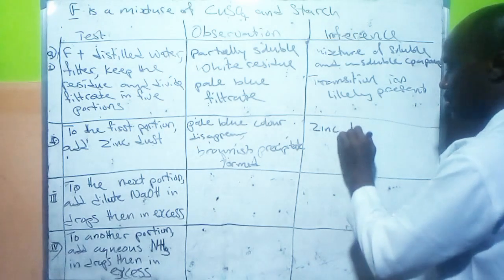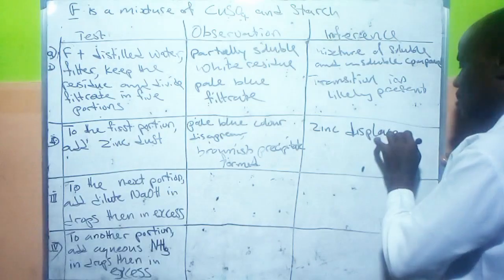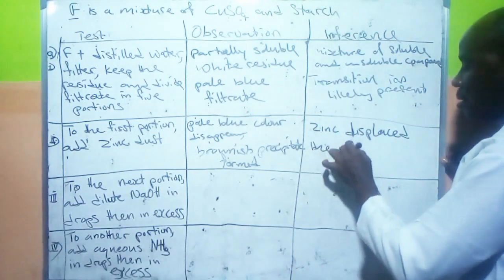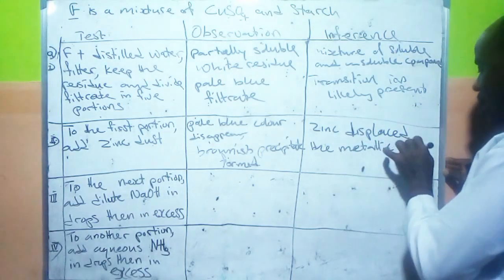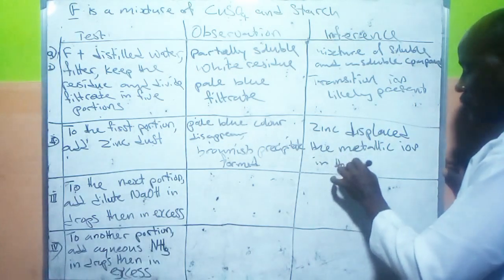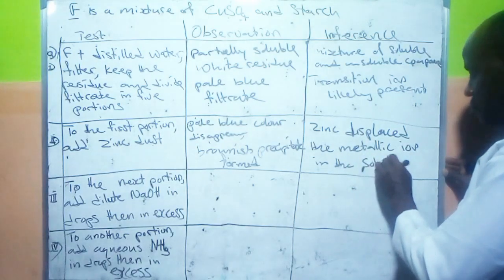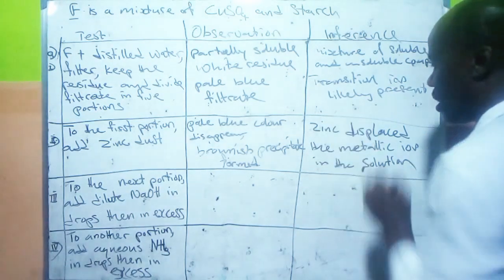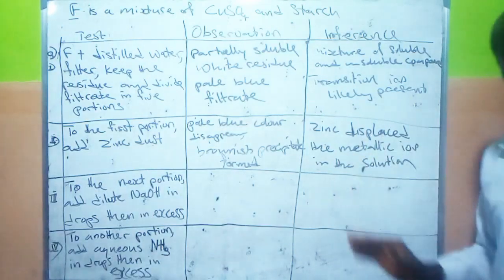Zinc displaced the metallic ion in the solution. That is exactly what the inference is telling us, that a displacement reaction is taking place.